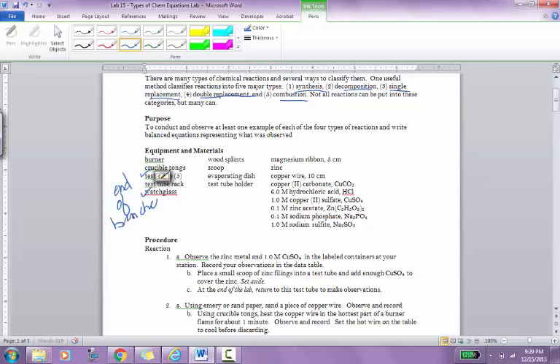The rest of the materials, things like this list over here to the right, this is in the red plastic holders that are on the lab bench tops for you to share with the lab group next to you. If you need something else that is not in your cabinets and it's on the list, let me know. I'd be happy to get it for you.